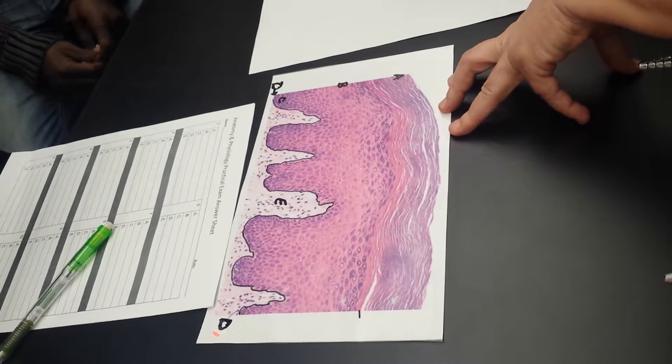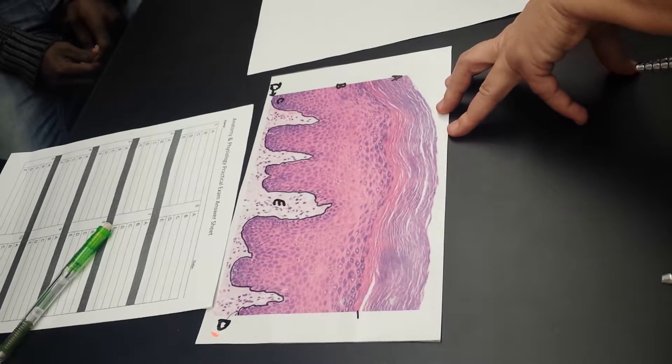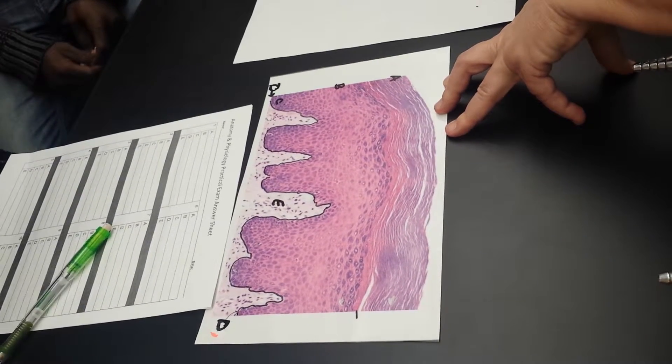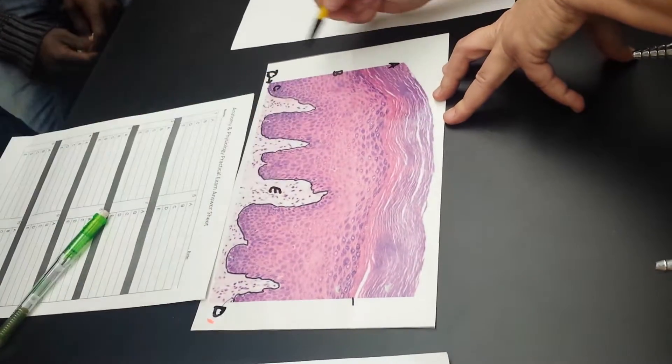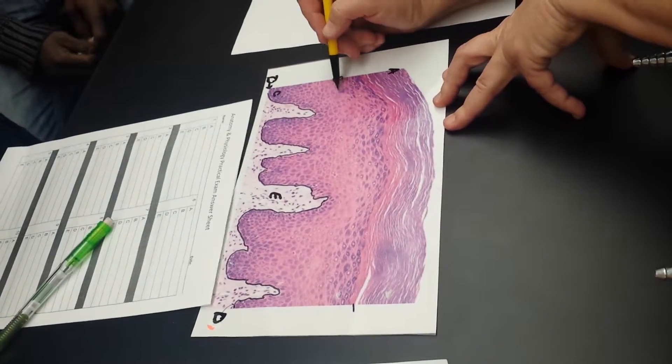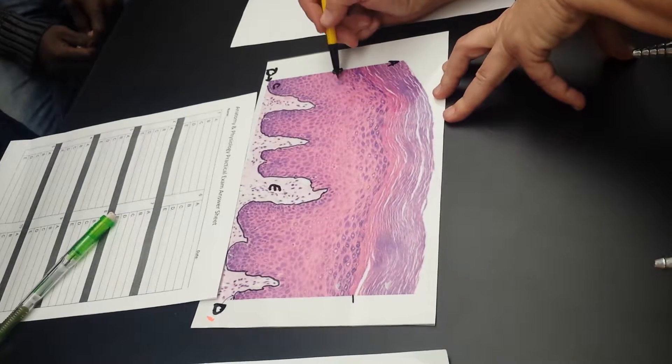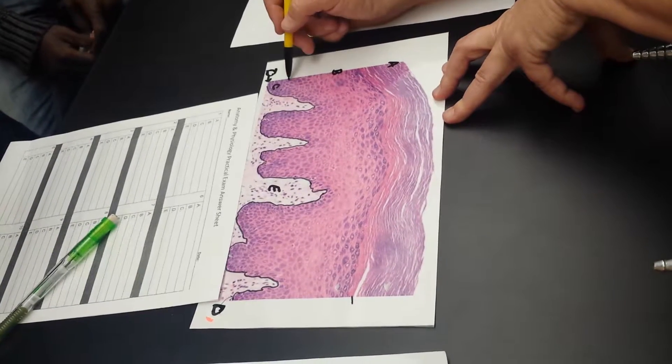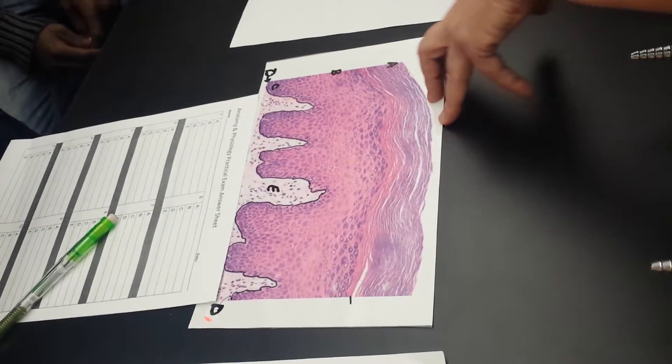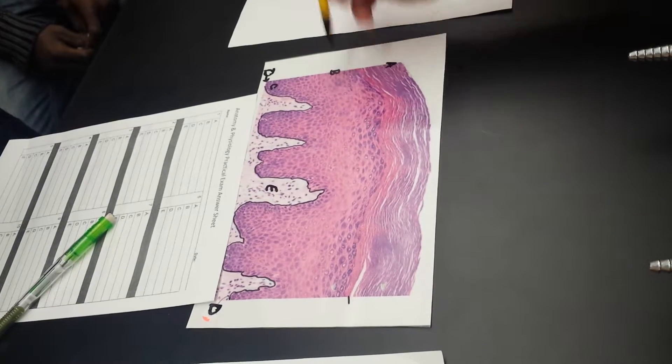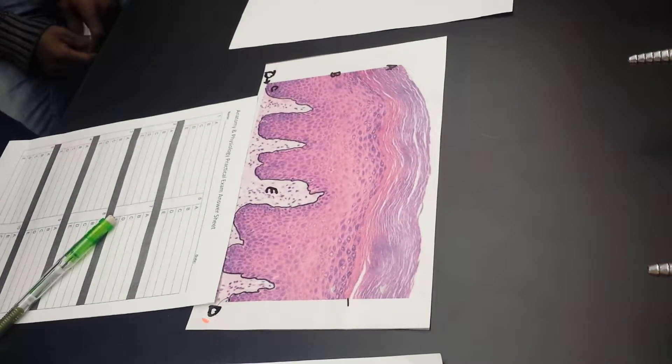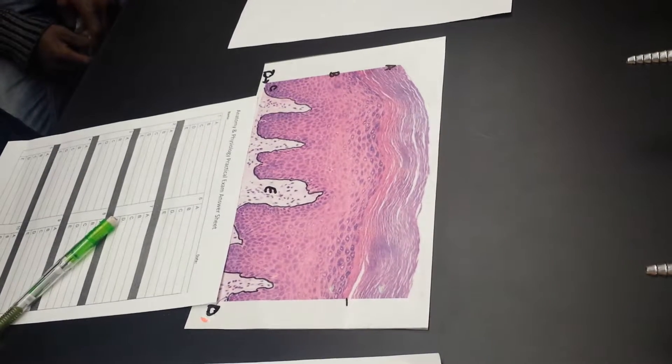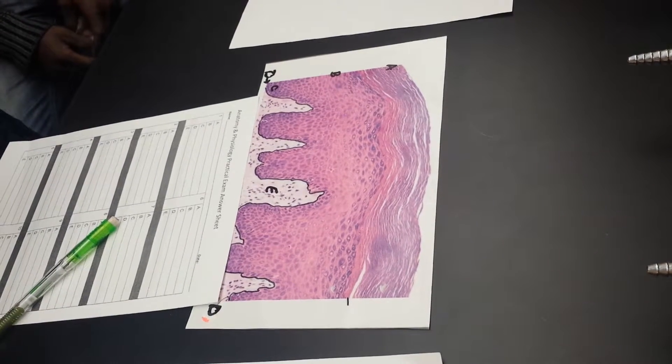So these questions asked for layer, but this one asked for tissue type. So what did you say that B is? B is stratum granulosum, I'd say from here, this is all granulosum, this is spinosum. I should have moved it up closer to here, I was rushing. So this C would be basal, at the bottom right now, at the bottom there? Stratum basal. Yep.